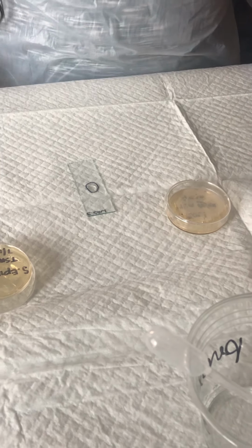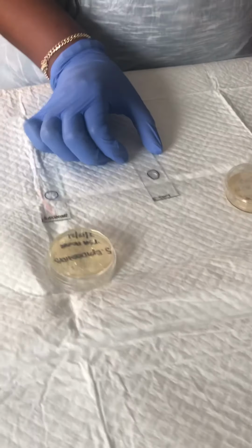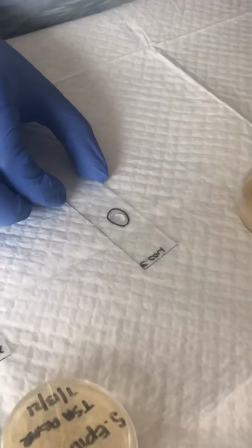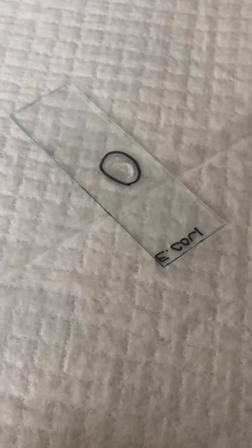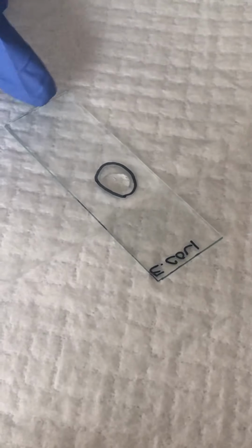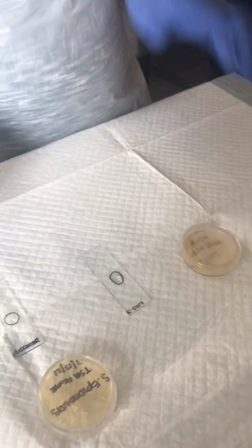And I do see some bubbling. Okay, and there I have some oxygen bubbles there.